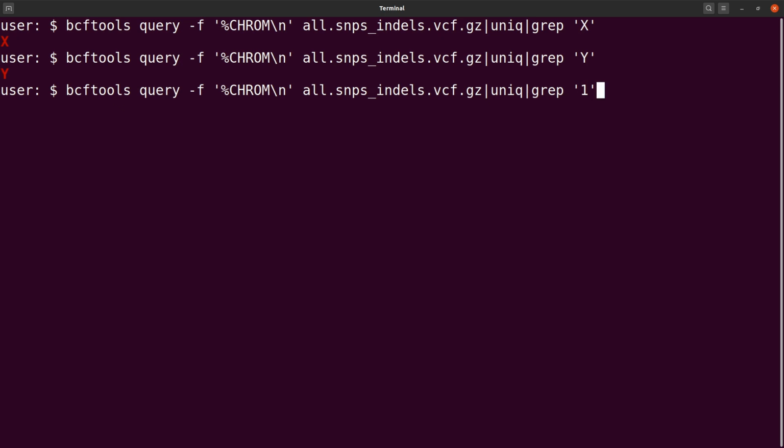chromosome 1. Let's see what you get. Okay, good. Yeah, so this one here brings another thing that we'll look at in the future one. Sometimes with a grep, especially with numbers and stuff, you need to add some additional information so that it becomes specific. It becomes very stringent so that we know what we want.